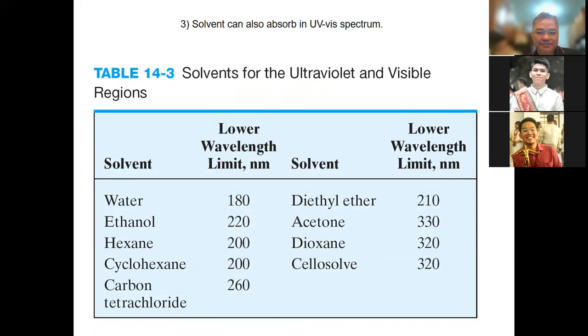Some other wavelength yung gagamitin mo, sir. Some other wavelength, ano pa? Blank. So you set this as your blank or C0. So everything is referenced to the blank. Okay. So that's one way to get around the problem with respect to the solvent.